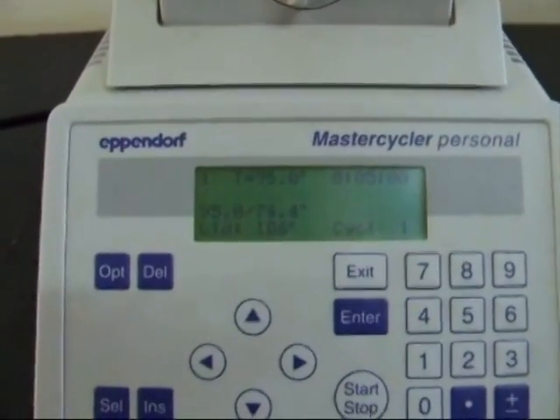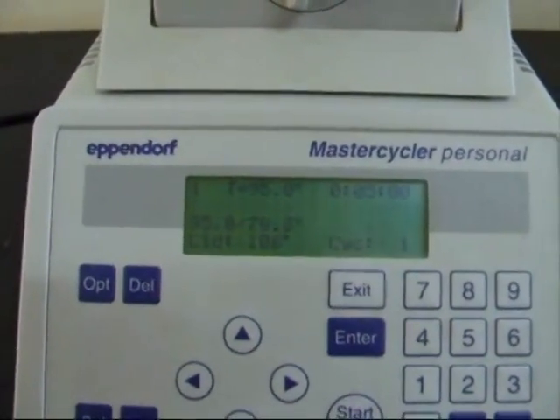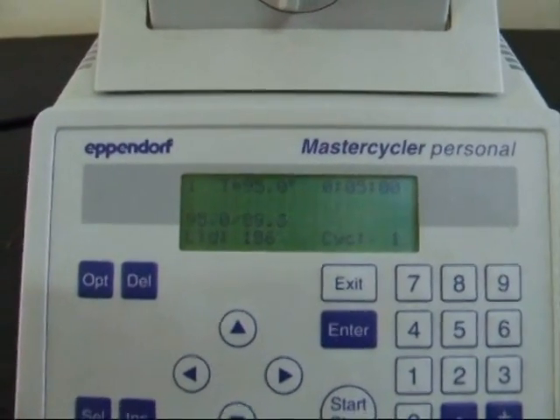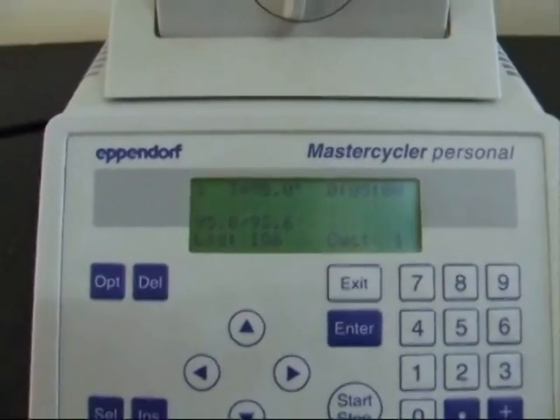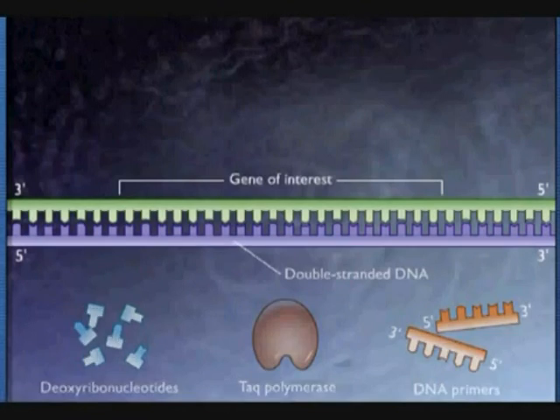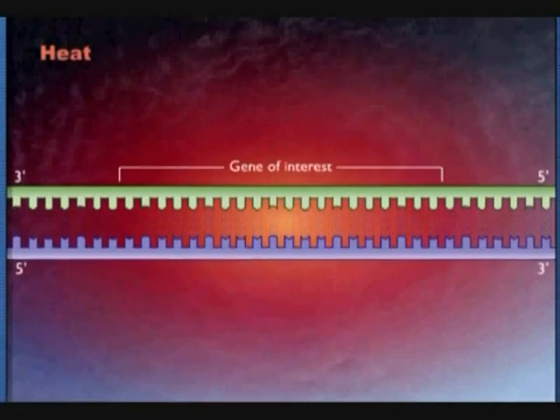As you can see, cycle 1 has started. It takes some time to reach 95 degrees centigrade. Once 95 degrees centigrade is reached, the reaction starts. Initial denaturation occurs where the two strands of DNA break apart.